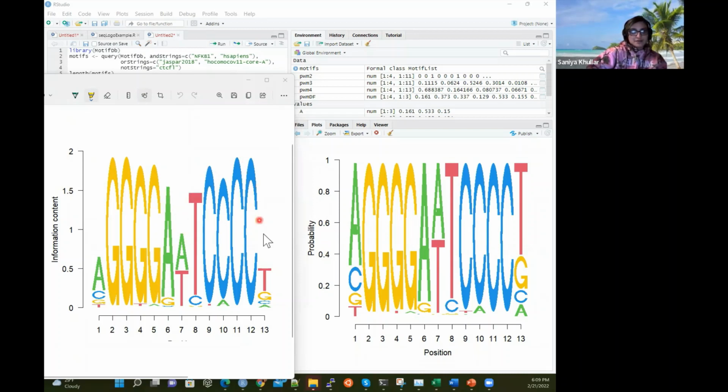So you can see how, when there is a bit more sharing going on and one base is not having all the thunder, the information content is not so high because it's sharing the spotlight. Like here, A is sharing some with T, so that's driving it down. So it could be either A or T; you're not as sure here.